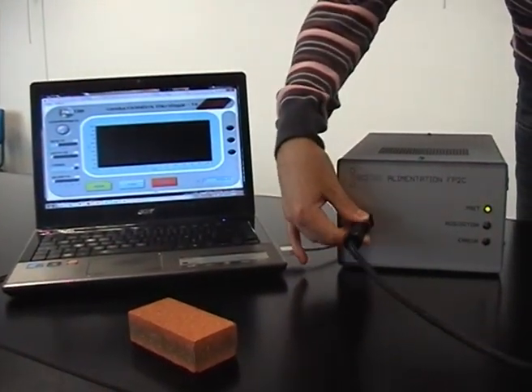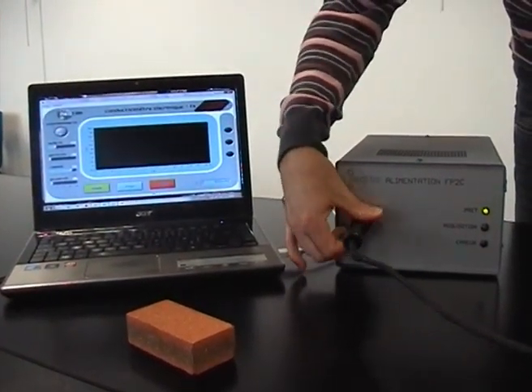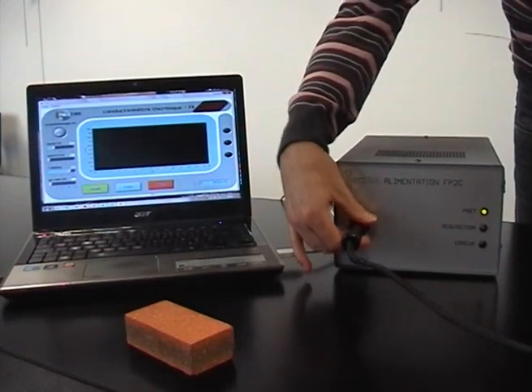Easy to use and effective, it can be easily transported in view of expertise or back and forth between production and research laboratories.